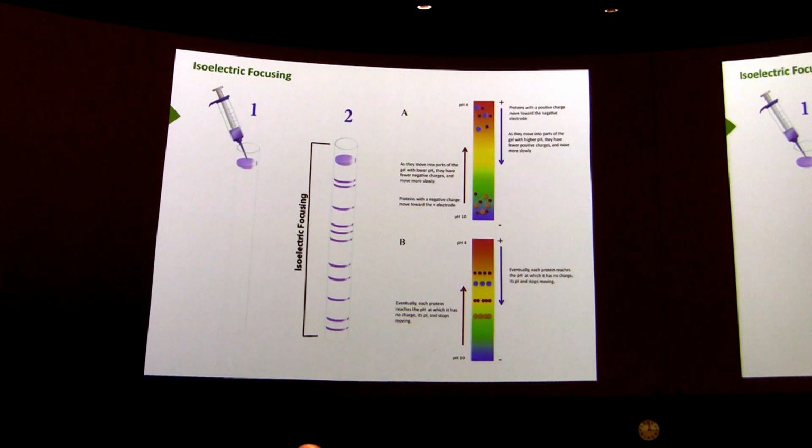Now, getting back to her question, is this better or worse than polyacrylamide gel electrophoresis? All these techniques depend on what you're trying to do. Polyacrylamide gel electrophoresis, or SDS-PAGE, would not tell us anything about PI. It would tell us only about size. This technique will tell us about PI, but it won't tell us anything about size. Did I say it backwards? I said it right? Okay. I forget what I said. So we get no information about size on this, whereas the other method we get size but no PI value. So there's no better or worse in terms of that.